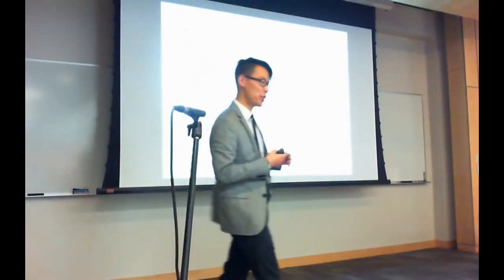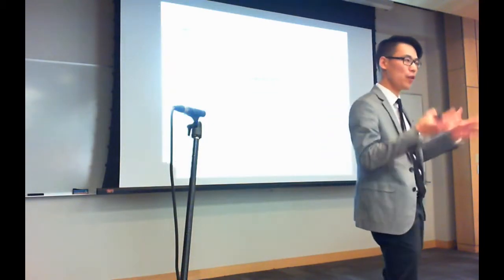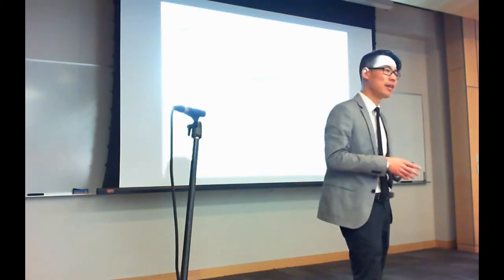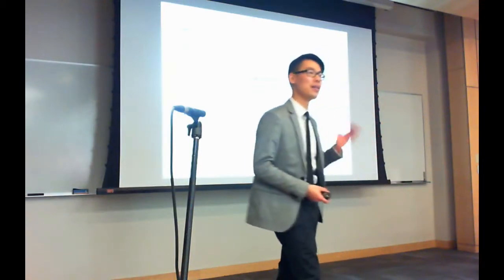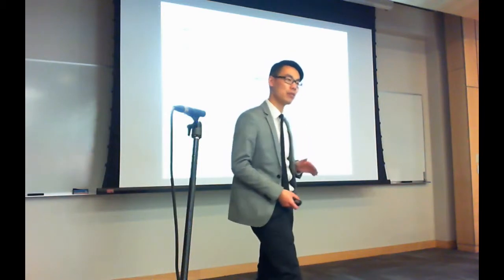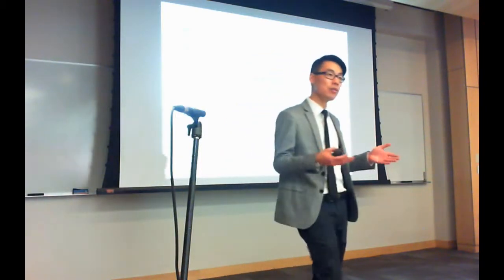And so there's two key components to this particular procedure. You want to be able to answer the question, given two spectra, how similar are they? And are they sufficiently similar for us to say that they're the same compound? That's spectral matching. And the second component is that the library has to be complete. The libraries have to be complete. If you have nothing in your library, you have nothing to compare against. And so that's what we'll be talking about today. First, how do we assess the similarity of MS/MS spectra, and how do we assign significance to that? And also, how do we start building spectral libraries in a scalable and an error-controlled way?